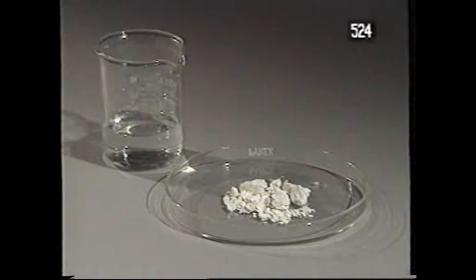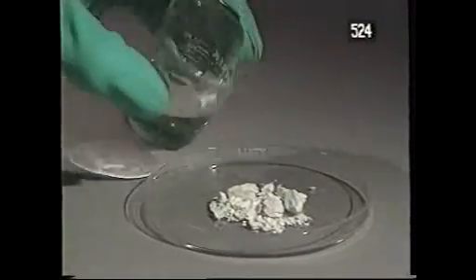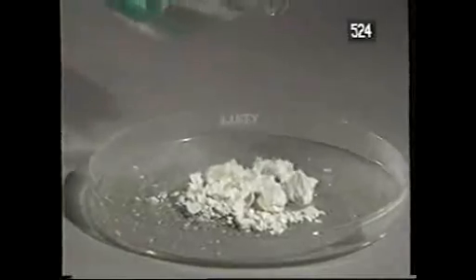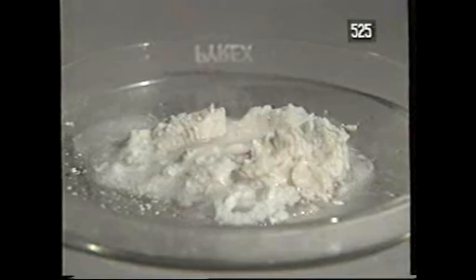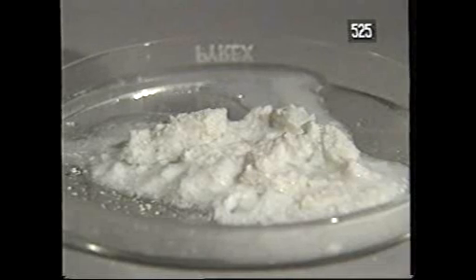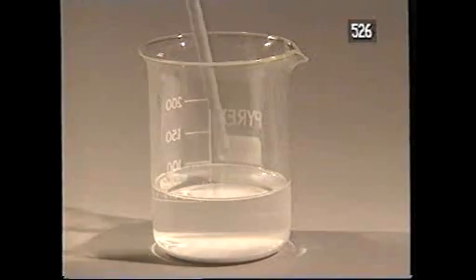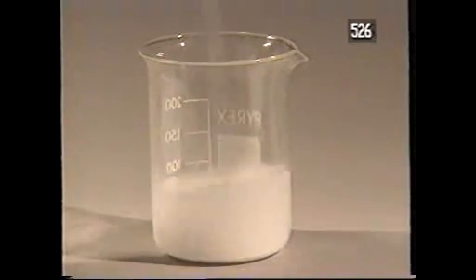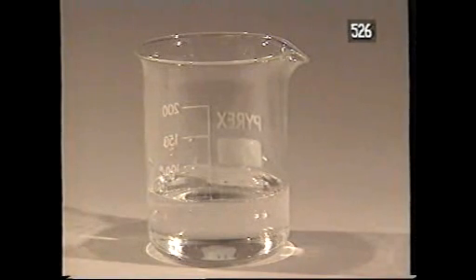This is quicklime, the stuff that's made in a lime kiln. I'm going to add a little water to it. Quicklime is very thirsty. It reacts vigorously with the water and produces something that's commonly called slaked lime, or calcium hydroxide. Slaked lime isn't very soluble in water, but if I stir some up and filter it, I get this, lime water.